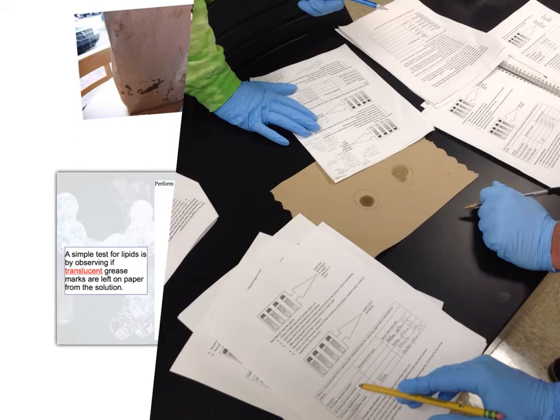So again, what you're going to do is you're going to make a circle of your sample. Okay? You're going to put a drop of your sample, and then you're going to wait, and you're going to let it dry. And so if you want to wave it around to make it dry faster, that's completely fine.